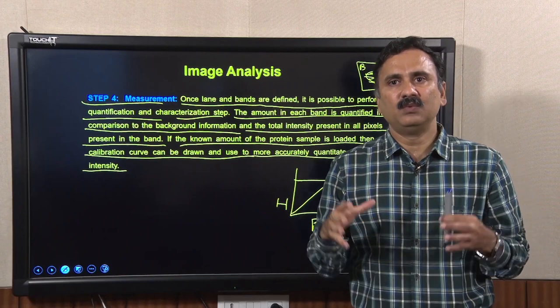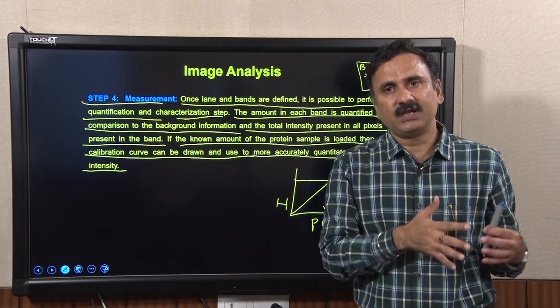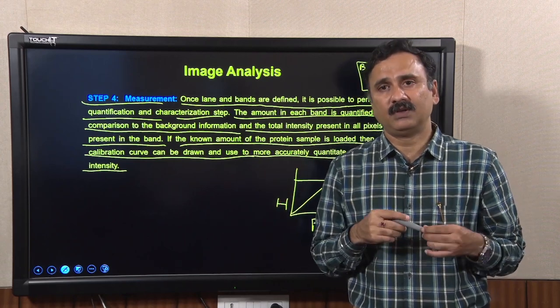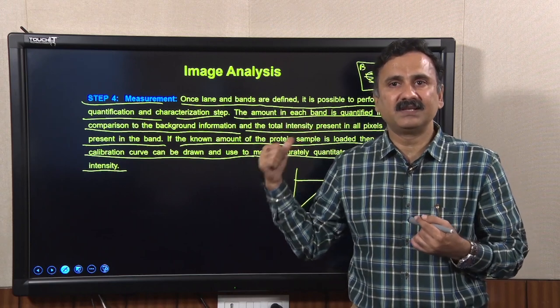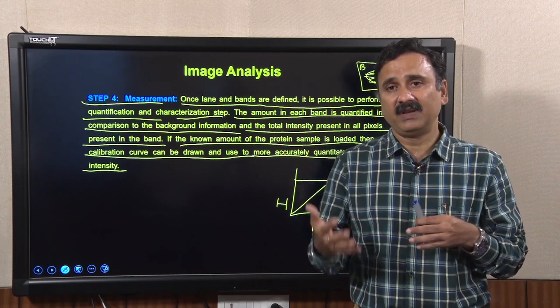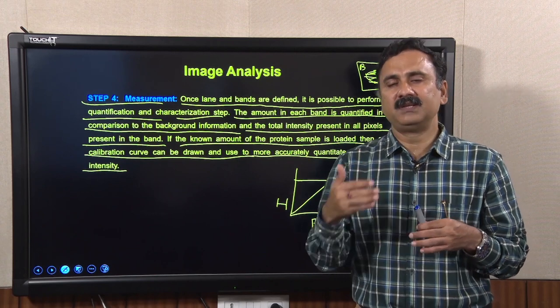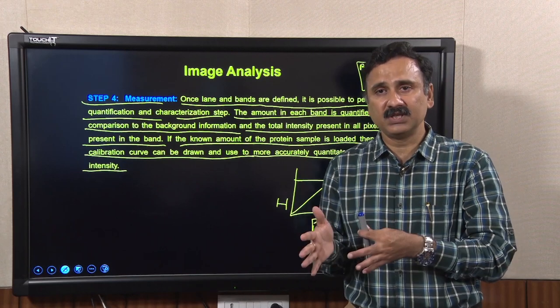Just to explain these steps in more detail, I will take you to my laboratory for an extensive demo on one of the softwares, where the students are going to show you each and every step with the help of the software. These softwares are available from the company, so they may not be freely available to you for practice, but I hope this demo is going to be helpful for you to understand the whole procedure.